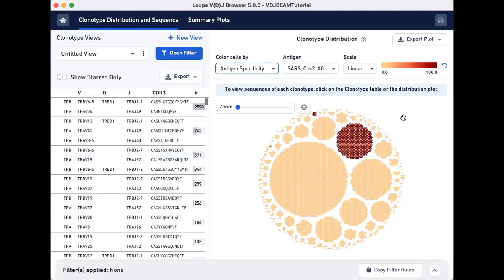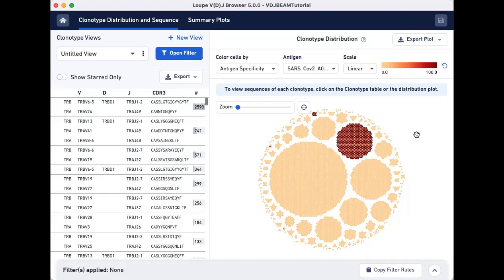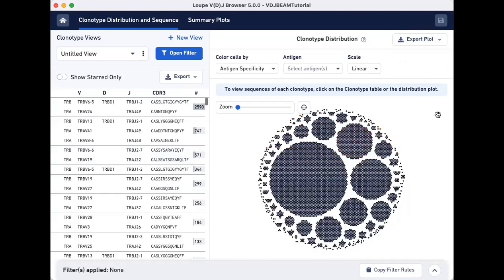To save this plot for future use outside of Loupe Browser, click on the Export plot and select either SVG or PNG formats. To reset the clonotype distribution plot to default settings, click on the Reset button located to the right of the color cells by settings.